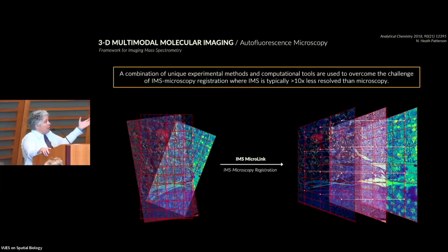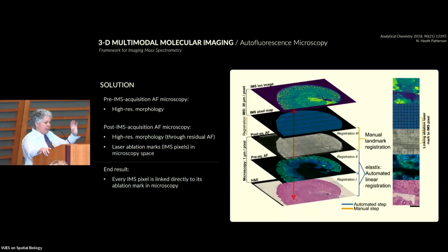Again, since we already developed the workflows for essentially co-registering the autofluorescence with the IMS, then we know that we can drag this into our 3D workflow. Again, really relying on those autofluorescence images to allow this to happen.